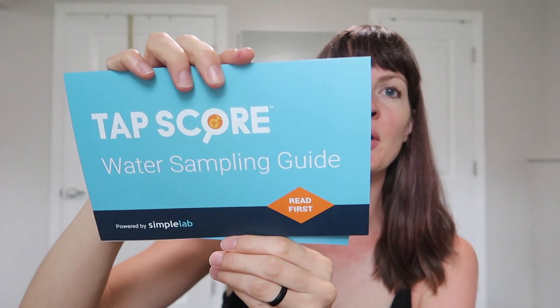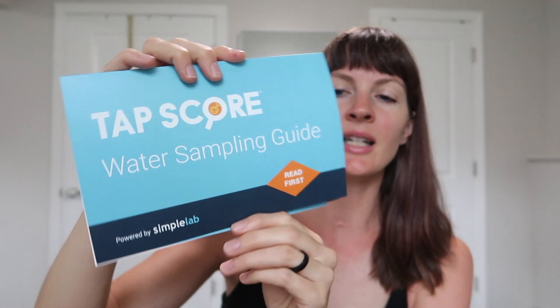So this is the Tapscore Water Testing Guide — read first, powered by Simple Lab. Follow the instruction card for accurate sampling, mail the sample to the lab, and you register online. Then they will review your lab results and prepare your report, and you'll receive email notifications as the results are completed and view them on your dashboard. It takes 3 to 14 business days, depending on your testing package.